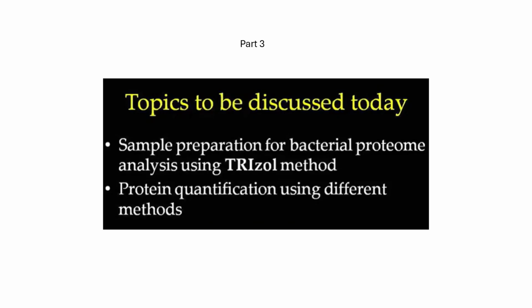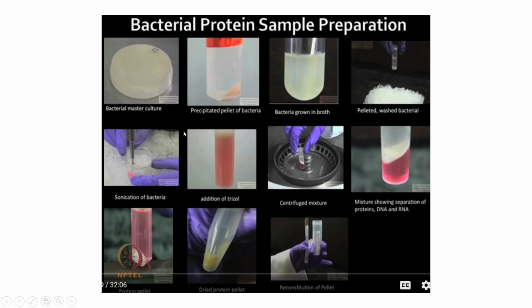one of the methods, which is the Trizol method, which is used for bacterial proteome analysis. So in that method, you are just using Trizol as an agent to extract proteins from the bacterial sample.